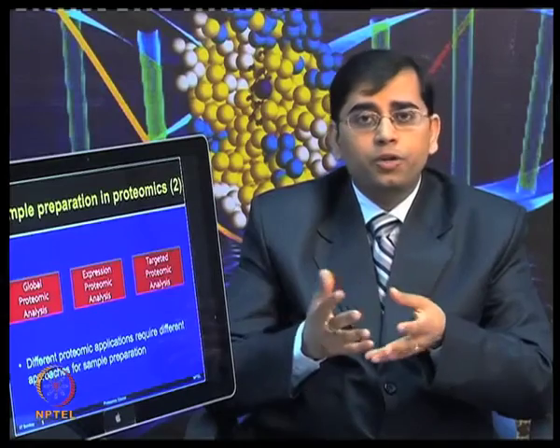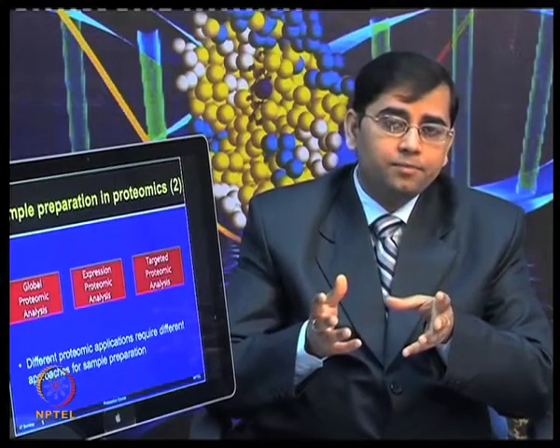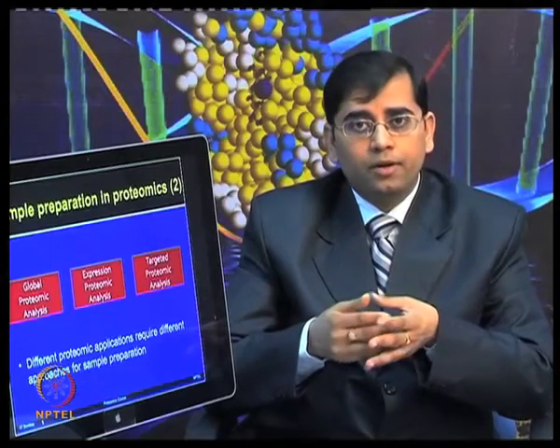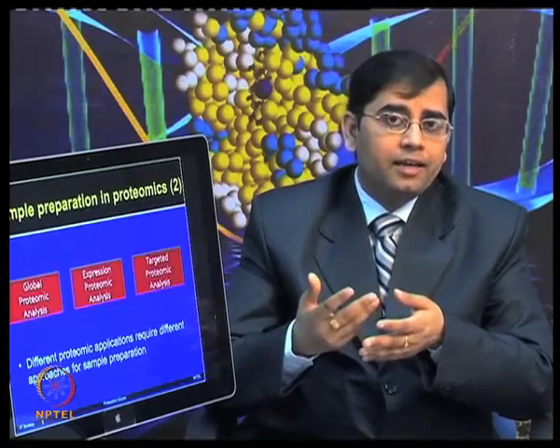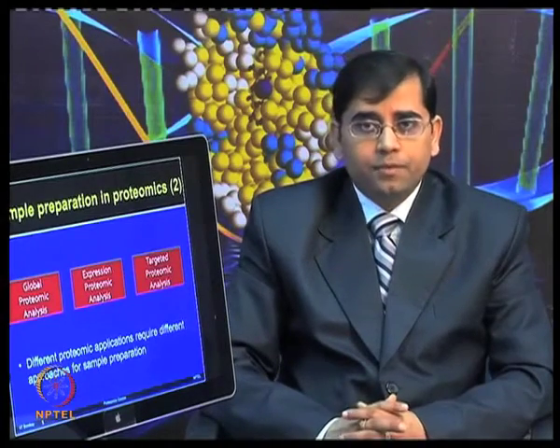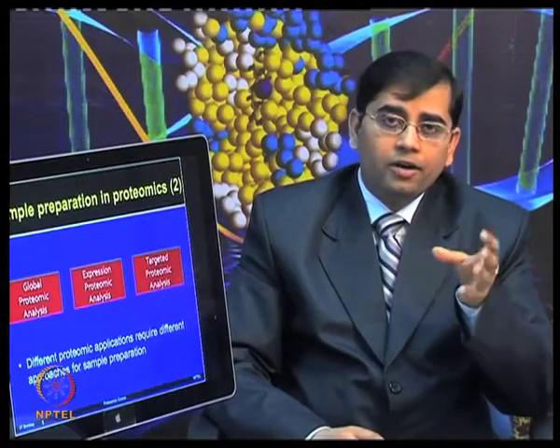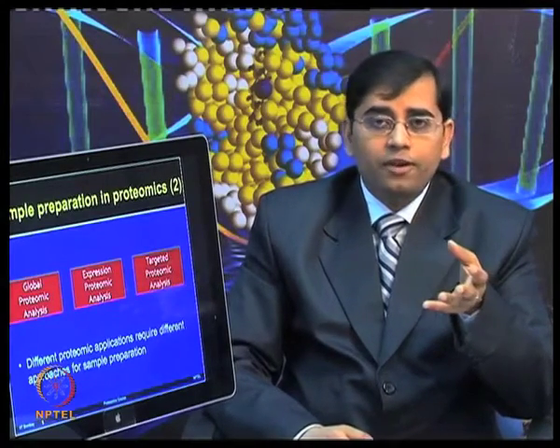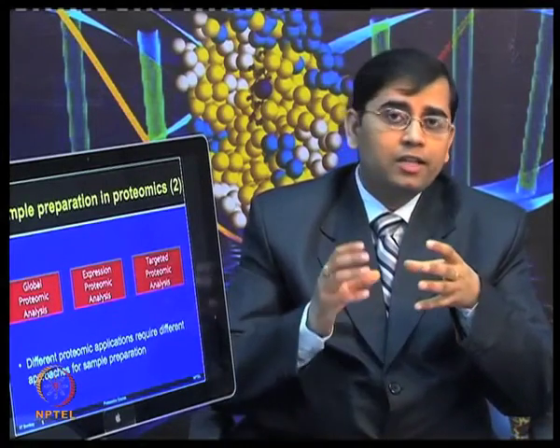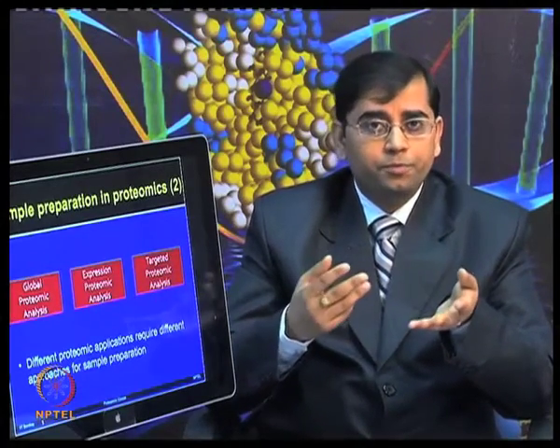The protein expression analysis is most commonly used for various types of clinical and other studies. Targeted proteomic analysis: if you are very focused on a given organelle or a given sample type, often you would like to know what is happening in that particular proteome, for example, the mitochondrial proteome.